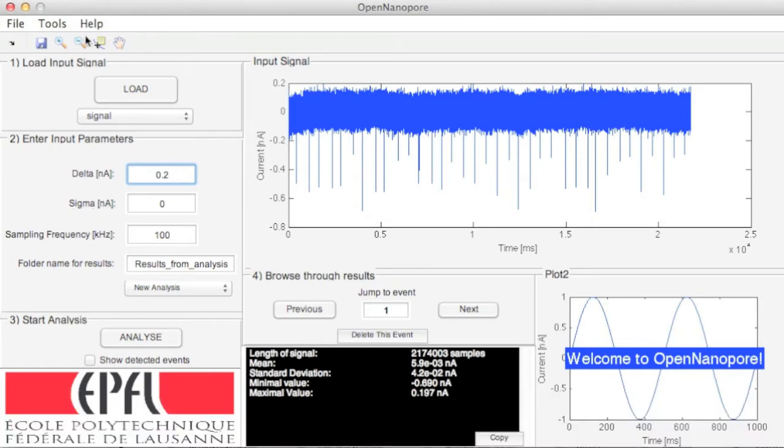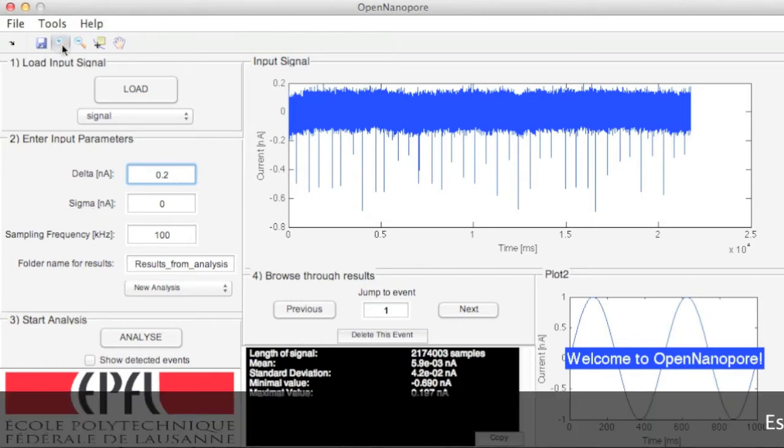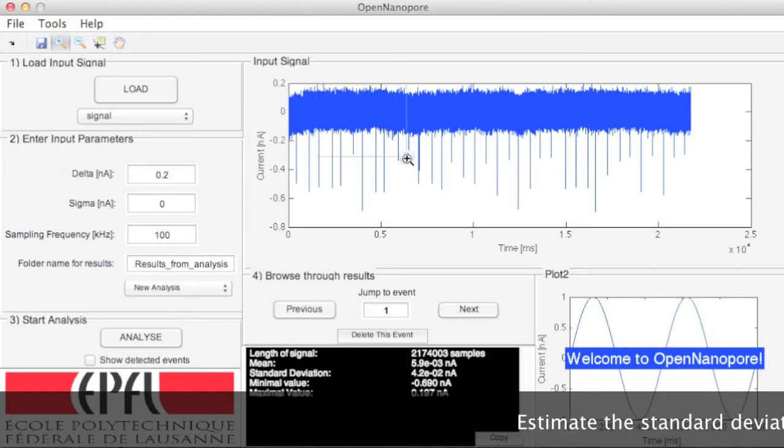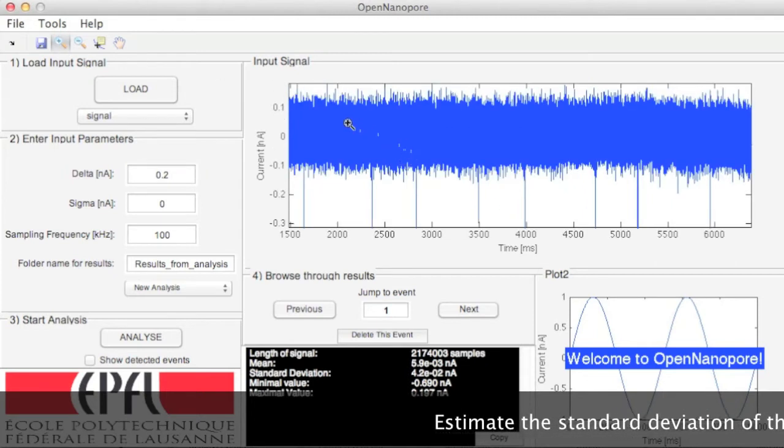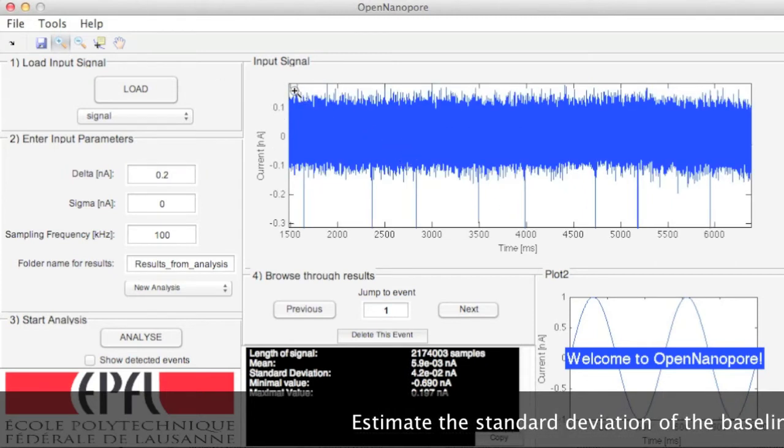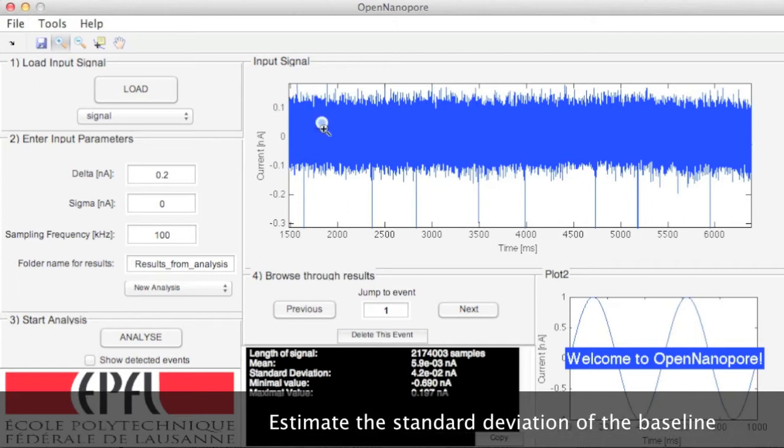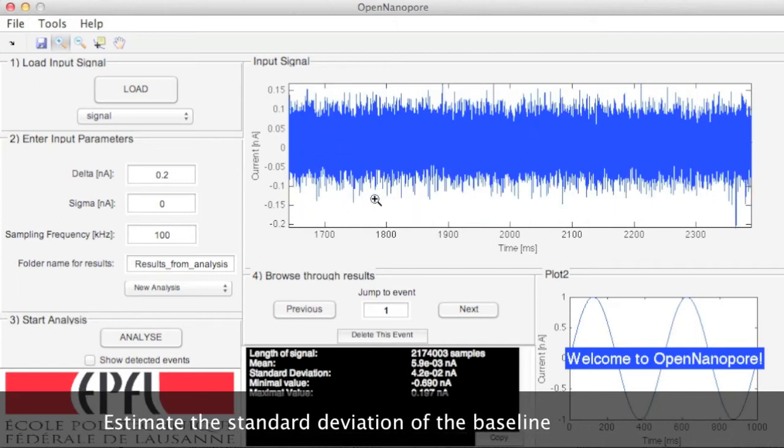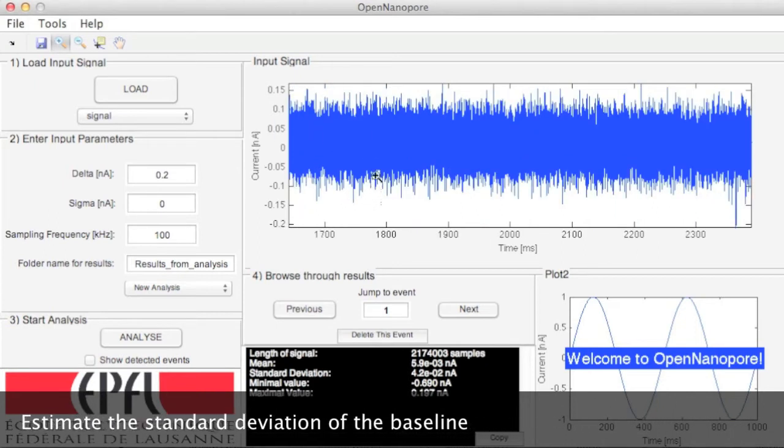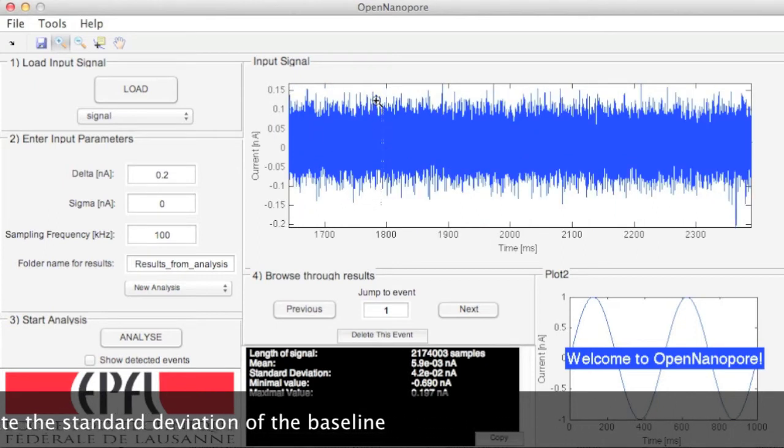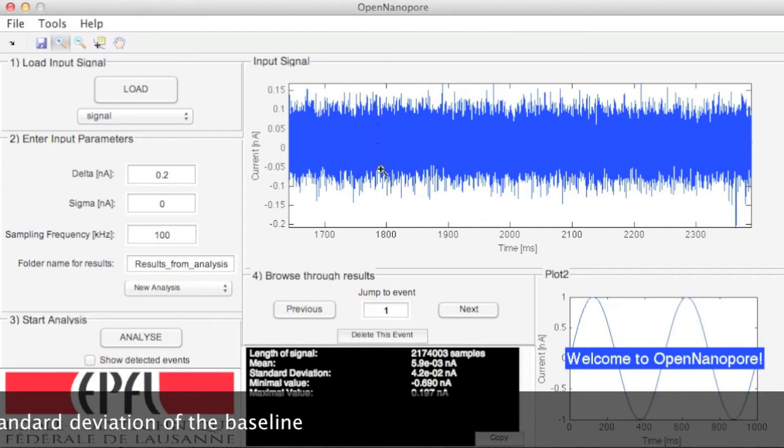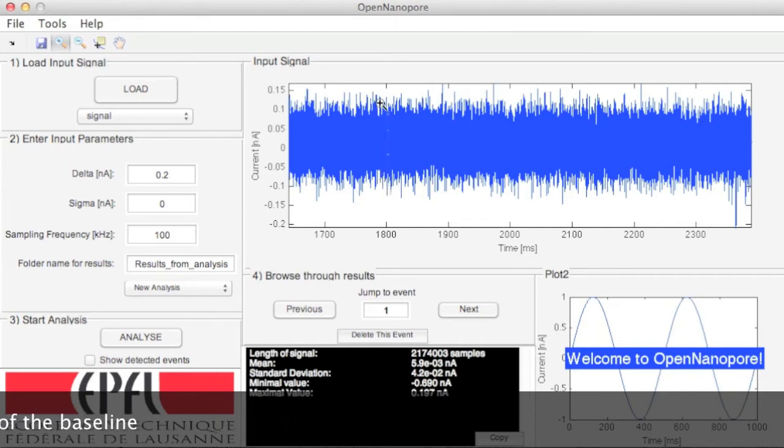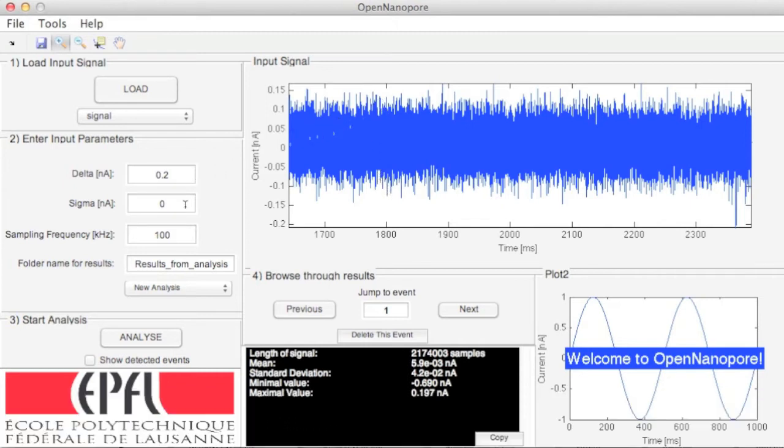Next, sigma is the standard deviation of the baseline, which takes a chunk of signal without any event and estimates the standard deviation. You can also calculate it using the standard deviation MATLAB function prior to analysis, where 1,000 points should be sufficient. In this demo case, 40 picoamperes is the root mean square value of the ionic current from this measurement.